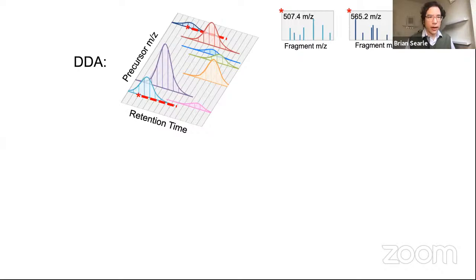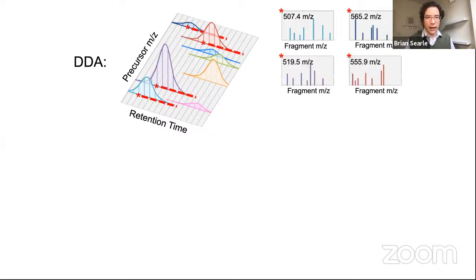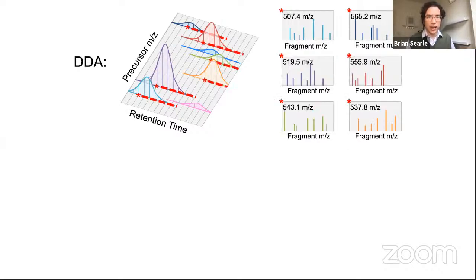And so then we'll go to the next peak, and then the next peak, and then the next peak, and we'll sequence all of these and give us an idea as to what's going on at each of those different peptides.